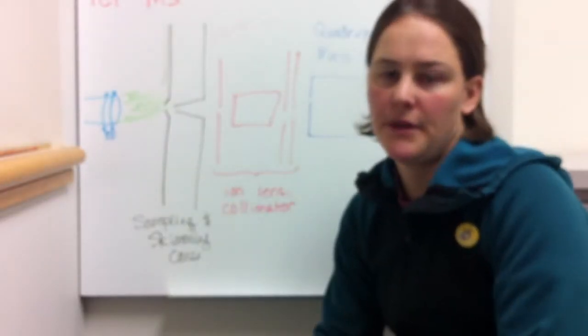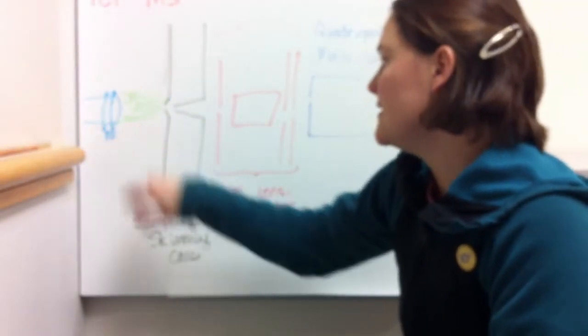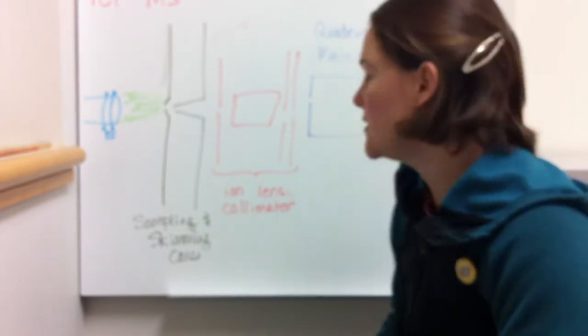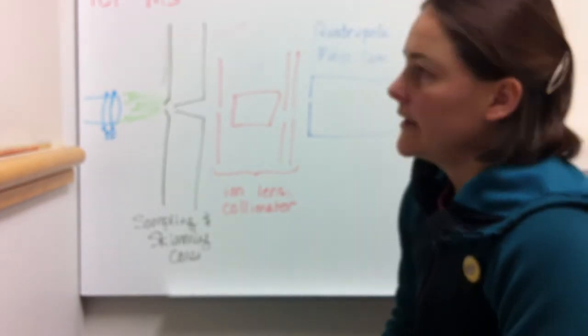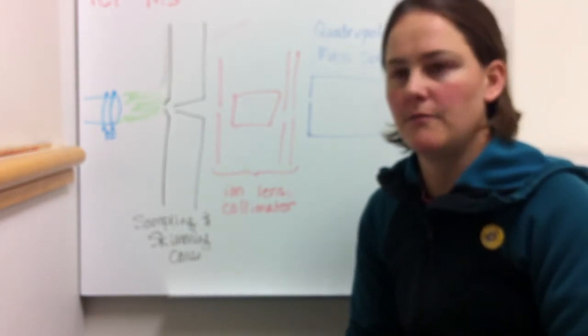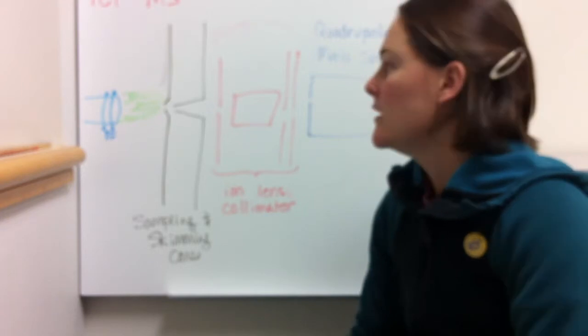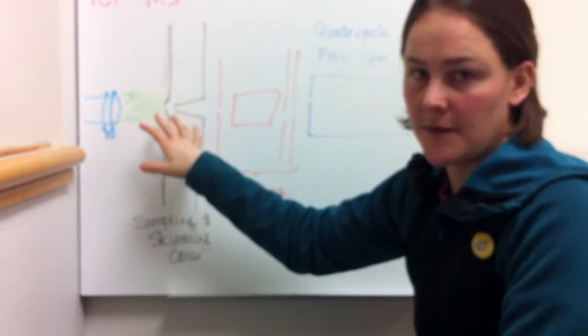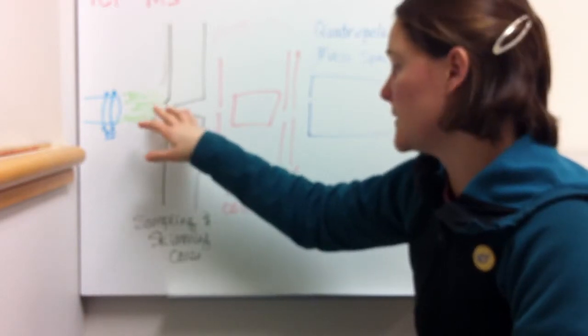So you couple the plasma, the ICP, with a mass spec on the back end, and I know that doesn't mean very much to you at the moment, but basically mass spectrometry separates on the basis of mass to charge ratio. So you have the plasma and a bunch of sample ions coming from the plasma.